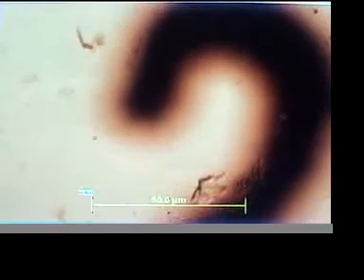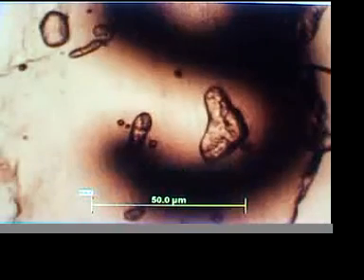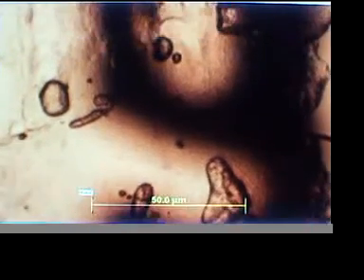And here comes number 2. See some Blepharisma swimming in number 2. Here's 3. So it does kind of show up on the videotape. And that goes down to 9 down here. Here's a 9. Right? Monster 9 in the videotape. So these are grid slides. Welcome to grid slides.